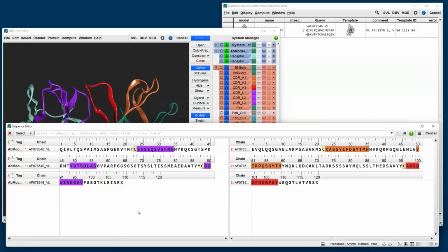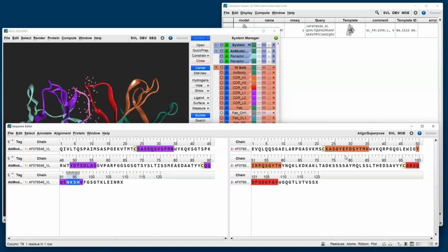It can easily identify exposed sites like oxidation-prone methionines. In this case, though, we're going to be searching for a glycosylation site using a prosite motif. So if I click on the pull down, you'll see some of the predefined options available to us. So I'm going to use the prosite motif with a note on exposure. I'll click enter, and I see within the sequence editor some residues have been selected, which indicate that a possible liability has been found.